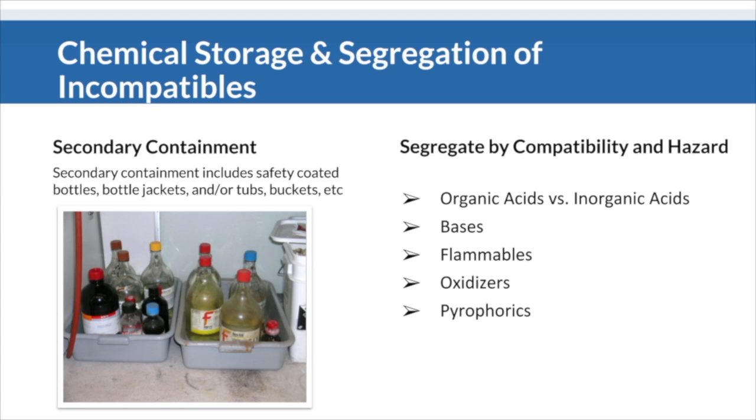Proper chemical storage involves segregating your chemicals by compatibility and hazard, not necessarily alphabetically, because that can be more dangerous if chemicals leak or spill and potentially cause a reaction.